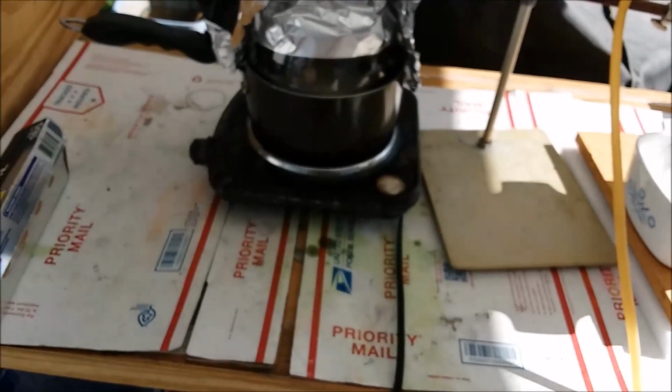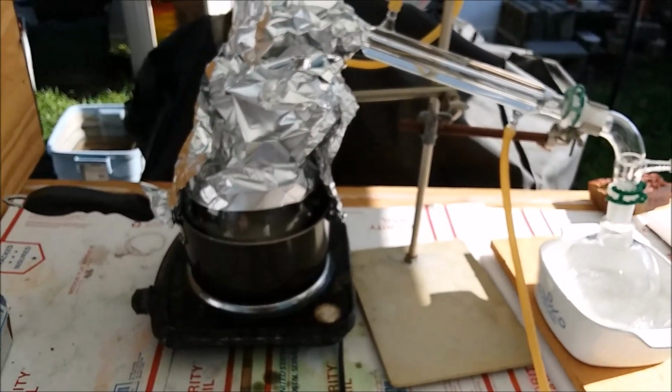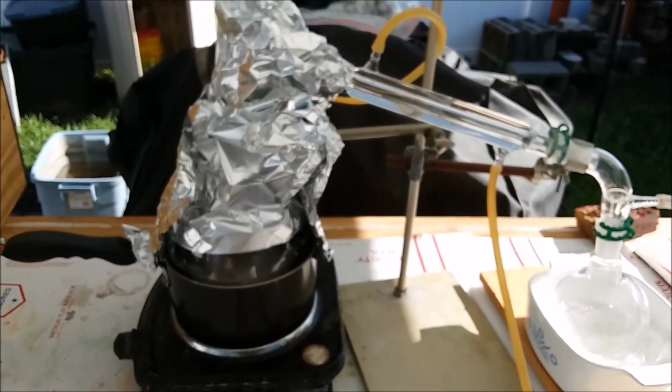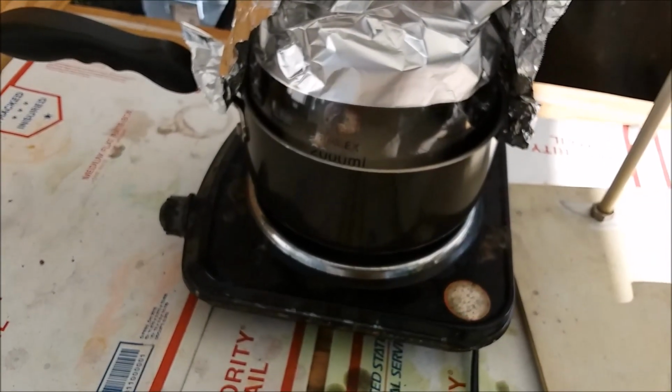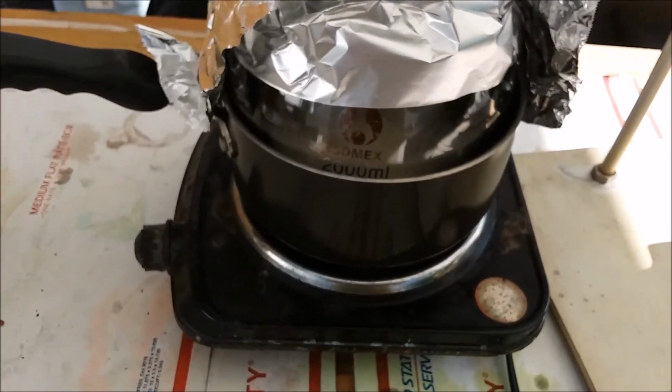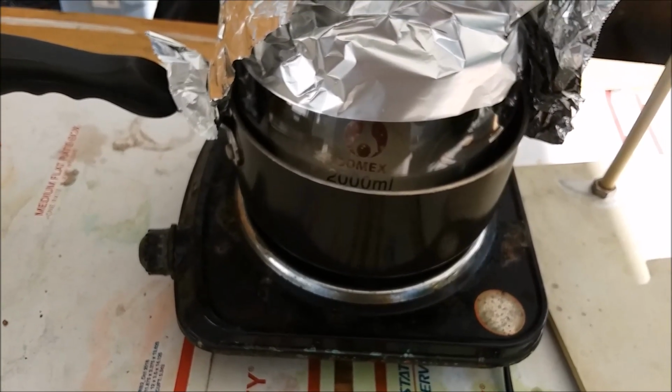Anyway, we've heated up enough that the smoking has stopped, and the cooling water in the condenser's on. So just waiting for the reaction to start. I see a little bit of bubbling in there, but it's pretty slow at the moment. But it'll get going soon.